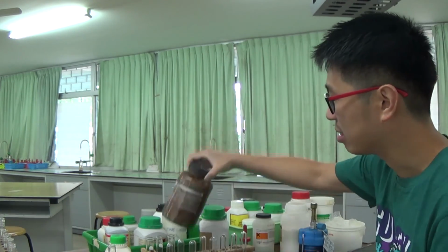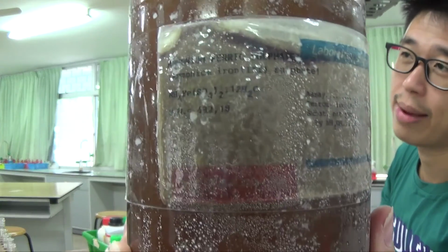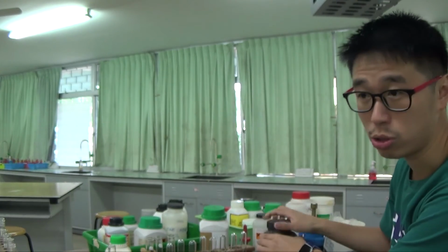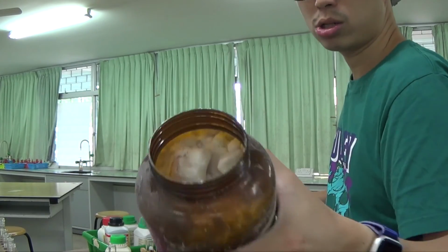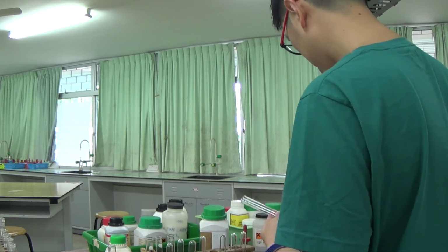I'm just left with the last thing that I want to show you. This is ammonium iron 3. This is different, right? Just now was ammonium iron 2. This is ammonium iron 3. The solid looks white, but that's because it's a mixture.